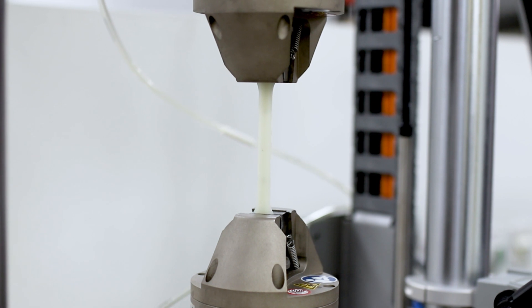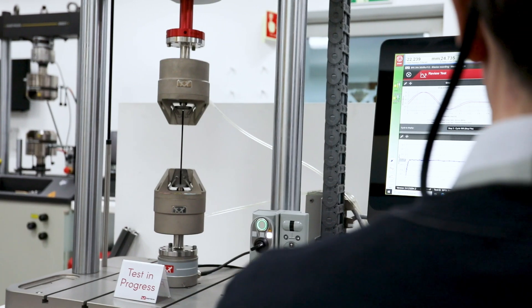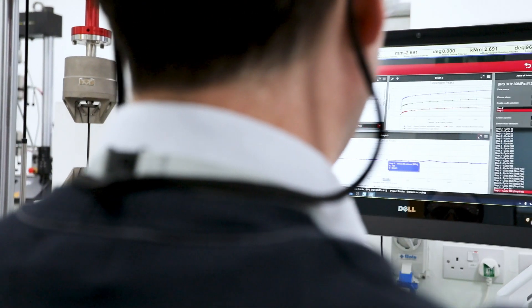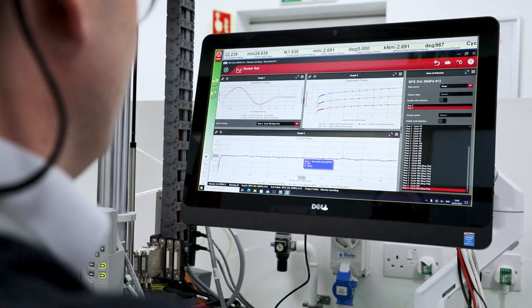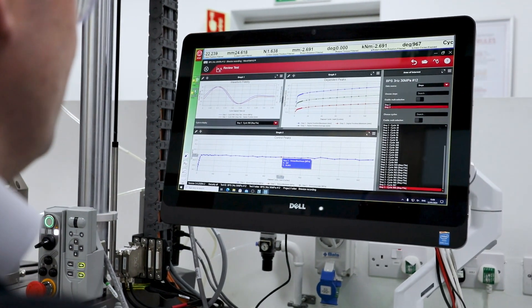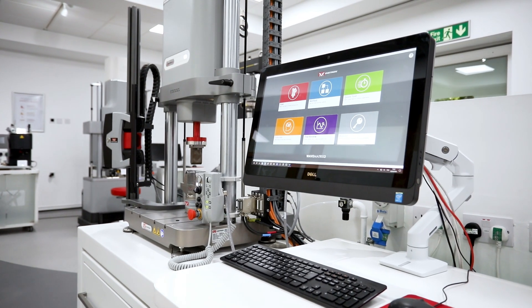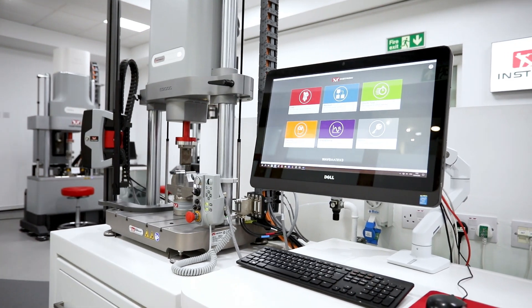Access Control in Wavematrix 3 introduces a simple tool to help keep things straightforward for less experienced users and to improve quality assurance for routine testing.